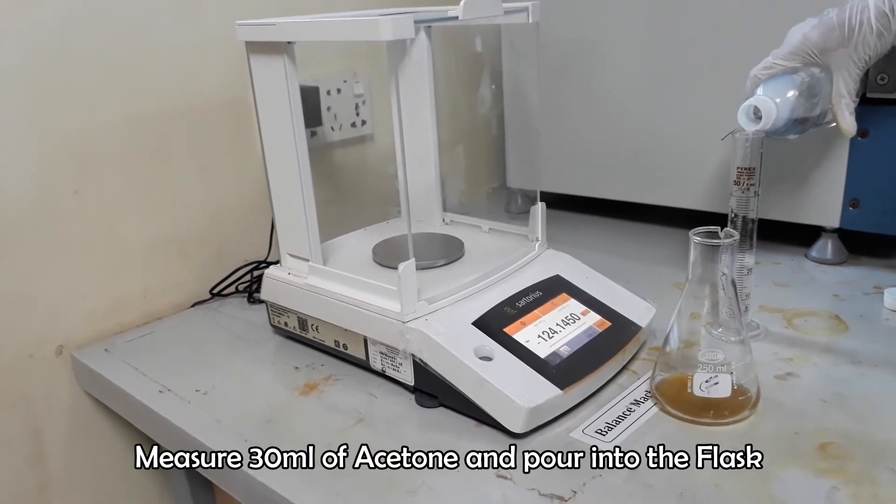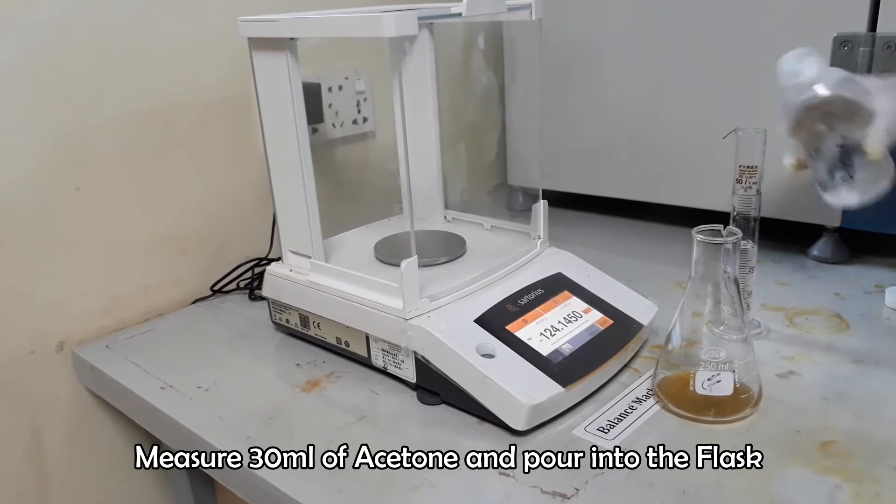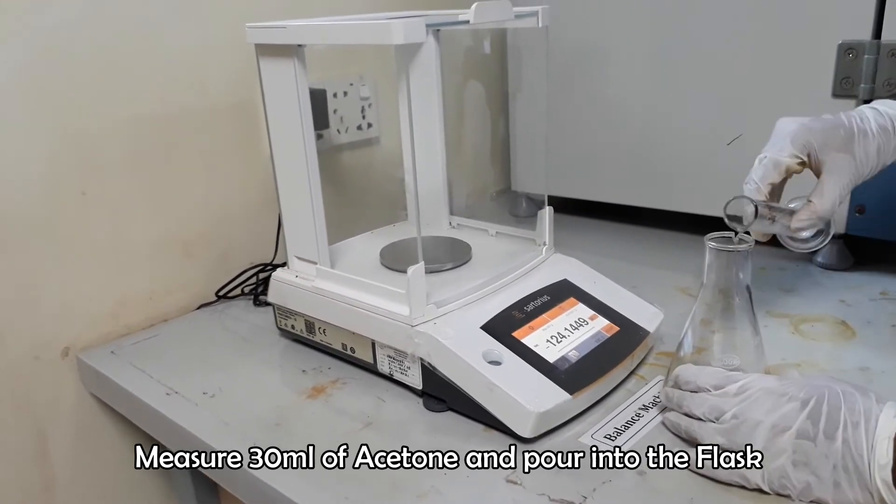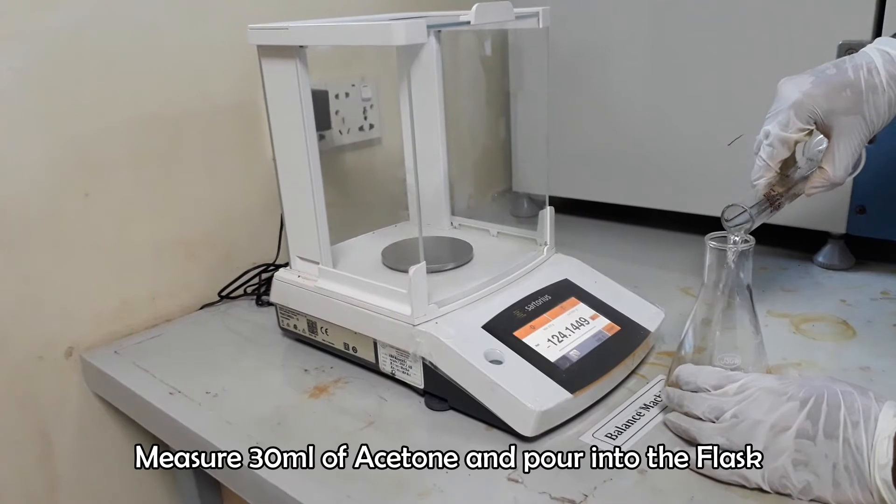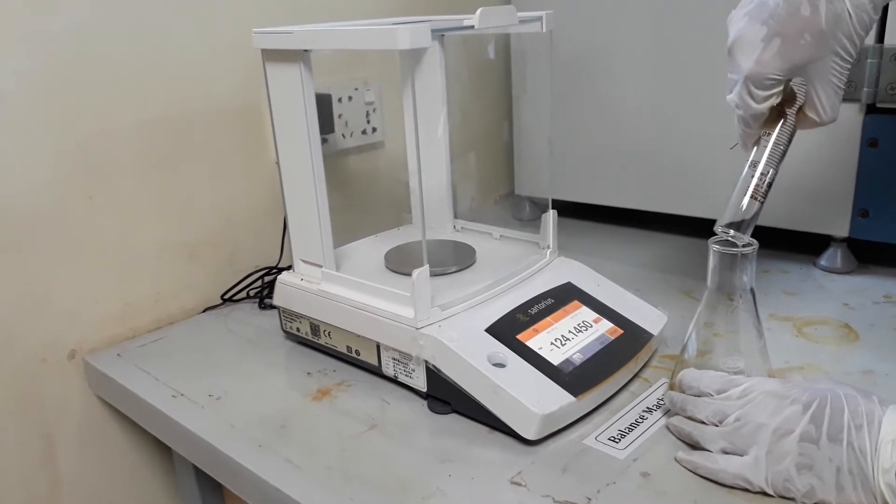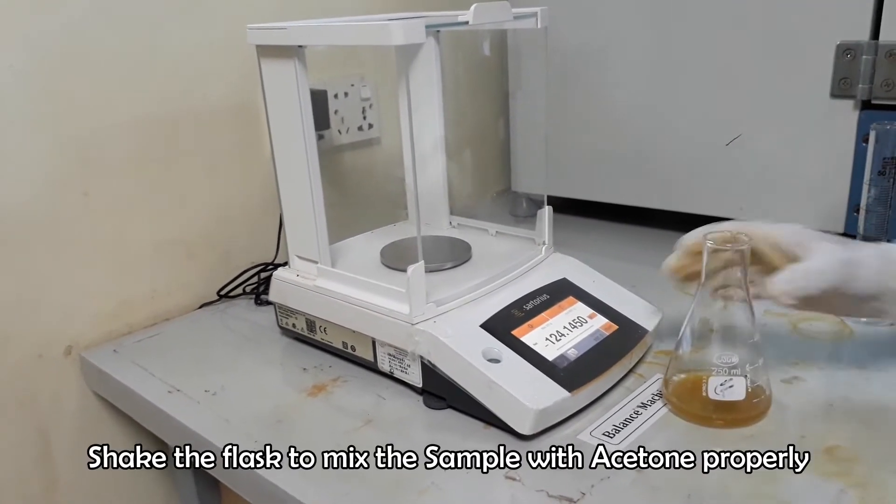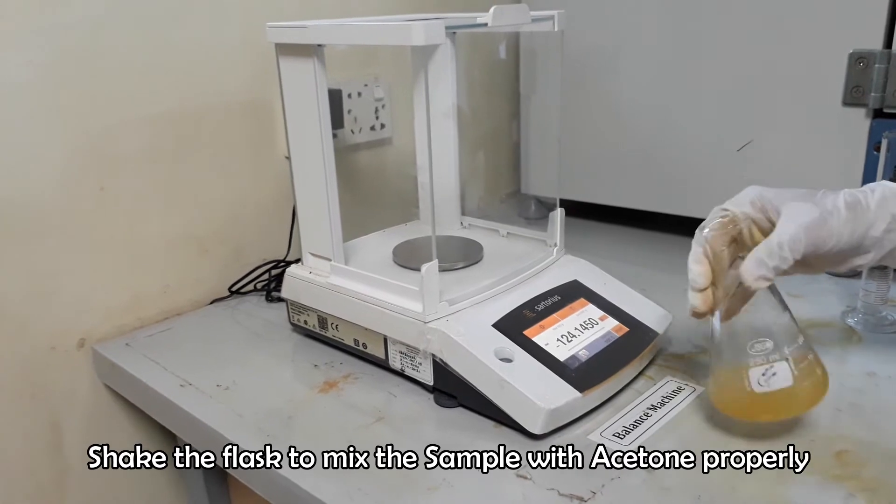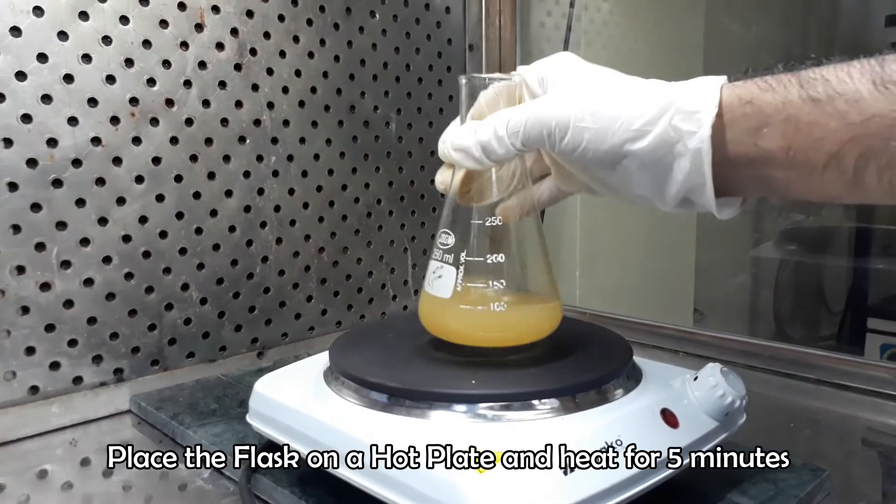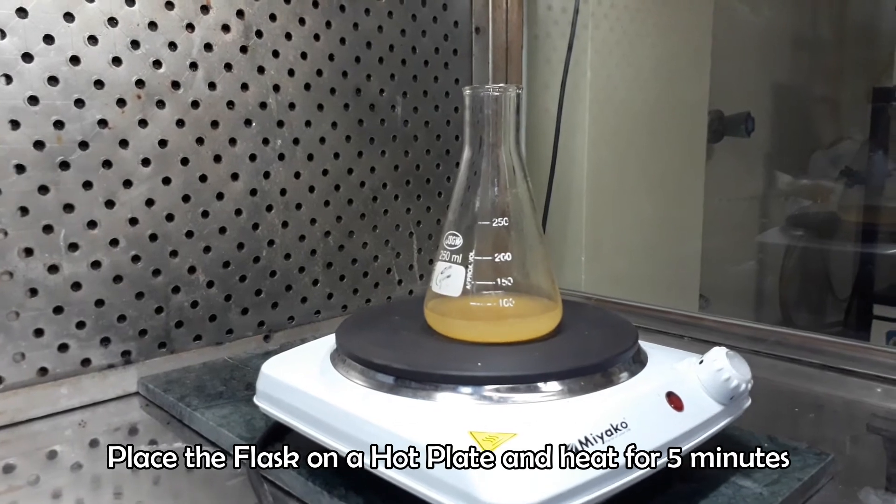Measure 30 ml acetone and pour into the Erlenmeyer flask containing the oil sample. Shake and rotate the flask to mix the sample with acetone properly. Heat the mixture on hot plate for 5 minutes.